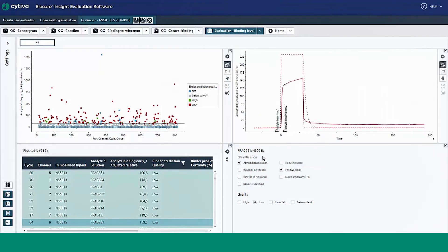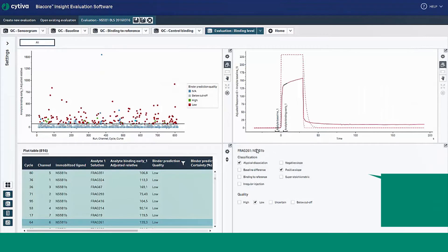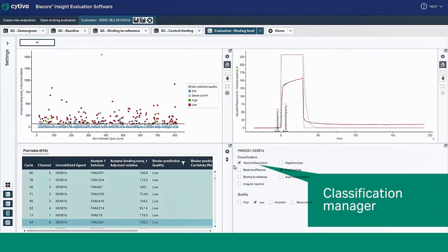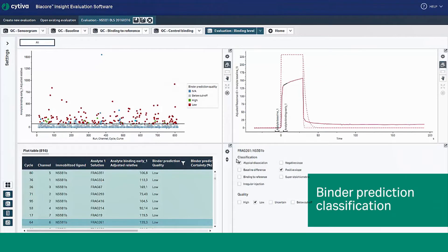Look under the sensorgram to find the classification manager, which is divided into two sections: the binder prediction classification and binder prediction quality.